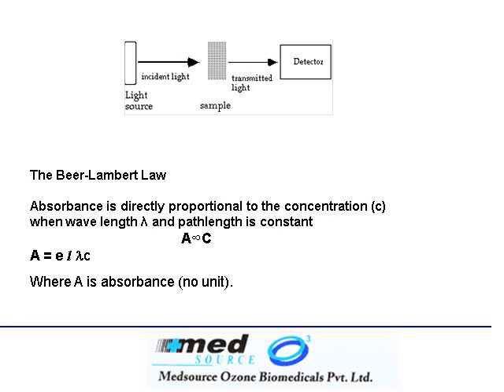Typically, the lamp will give light which will fall on the sample. If the sample has a dark color, then a lot of this light will be absorbed and a small amount will be transmitted to the detector. And if the sample has very light color, then almost all the light would get transmitted onto the detector. By measuring the amount of light which passes and gets transmitted, we have an idea about the light which is absorbed. Less is the transmitted light, more is the absorbed light. So a spectrophotometer works on this principle and it simply measures the amount of light absorbed by the sample.